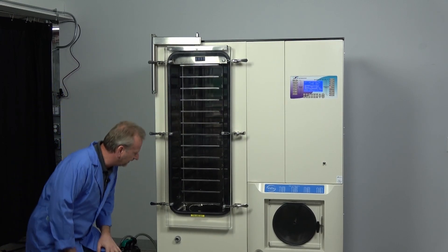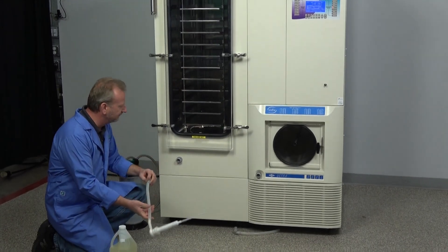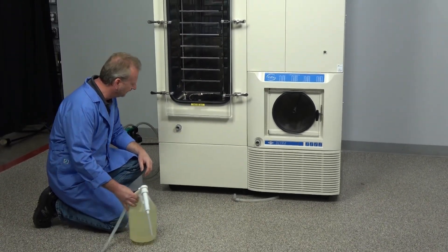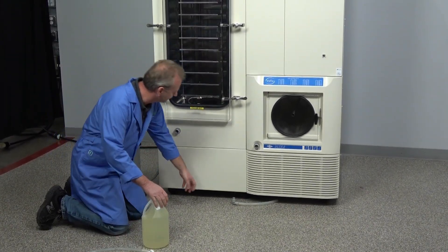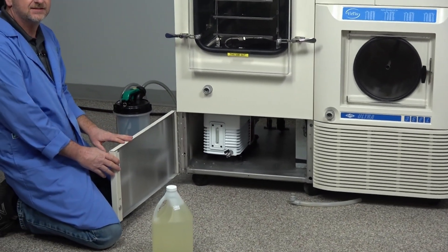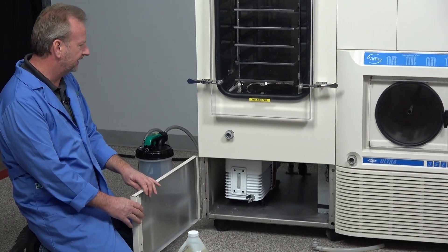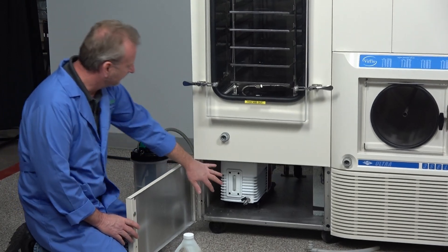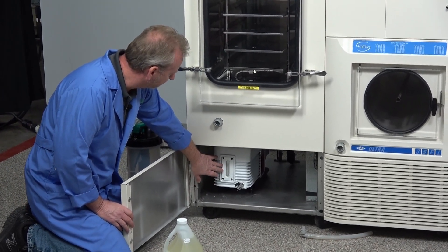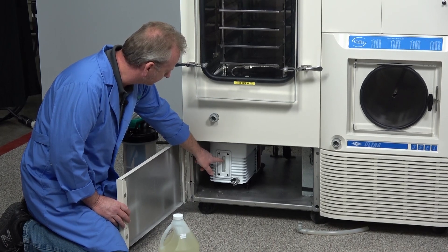Down here, I'm going to point out some things we've added that really make it convenient. A lot of times on the Ultras, you don't have easy access to the vacuum pump. So we've actually added this access door here where it just swings open with a magnetic shut. It gives you complete access to the vacuum pump so you can check the oil levels and make sure they're good and consistent.